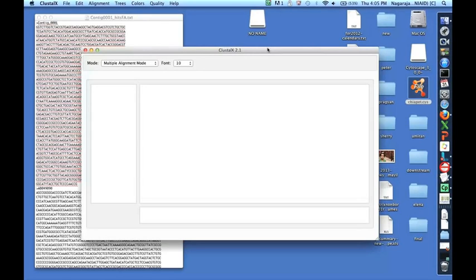In a similar vein, if your data are amino acid sequences and have conserved domains in different regions of the sequence, such as some are closer to the amino end and others are closer to the carboxyl end, then you should use another multiple alignment program that uses a local alignment algorithm.